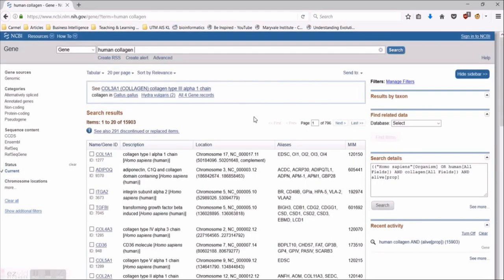Again, the beauty of the NCBI database is that everything is simplified in such a way that you'll be able to know where and when you can get the information. Once again, you always have the search bar at the top, and then a left section, middle section, and right section. The middle section will always bring you back the results, while the left or right section will provide other links related to the section. So what do we see here?